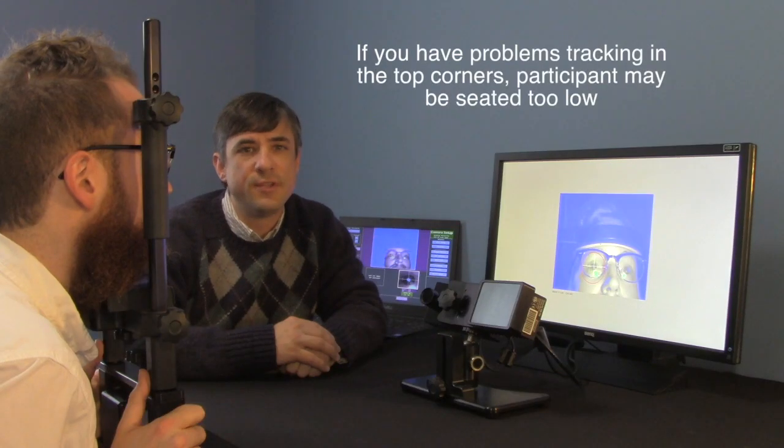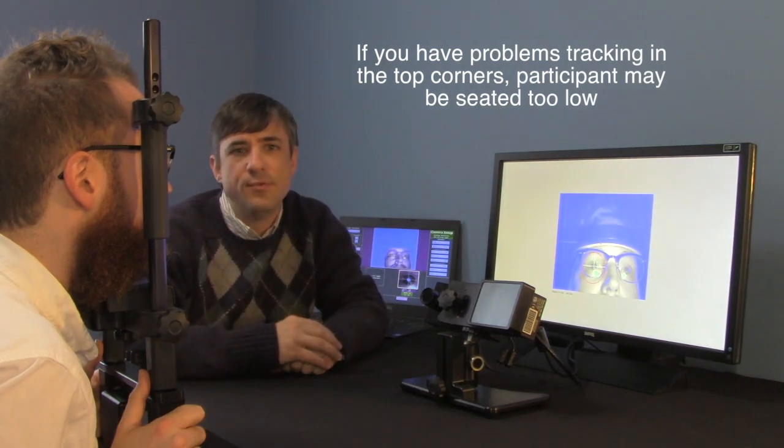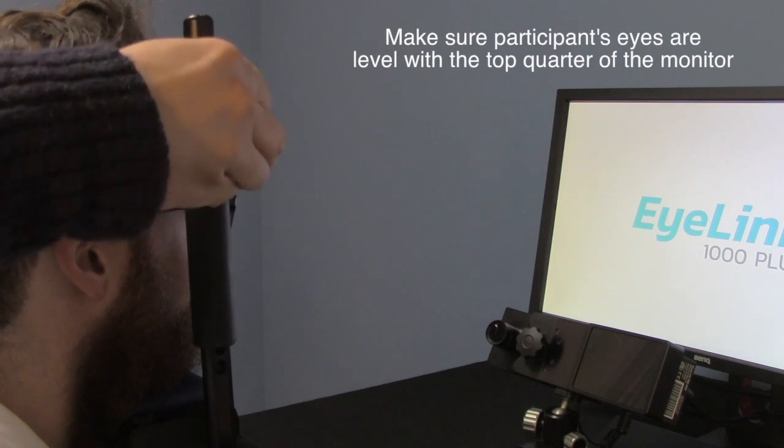If you notice that you sometimes have difficulty tracking participants at one or both of the top corners of the screen, the participant's eye may be a bit too low. So make sure the participant's eyes are level with the top quarter of the monitor.